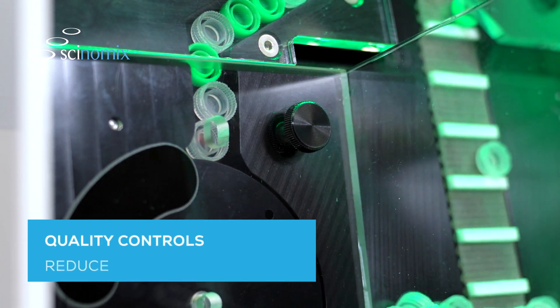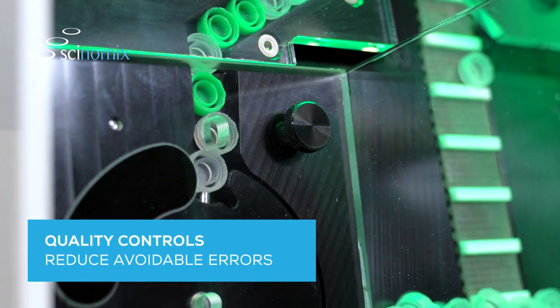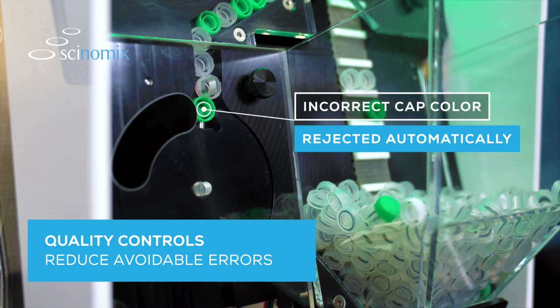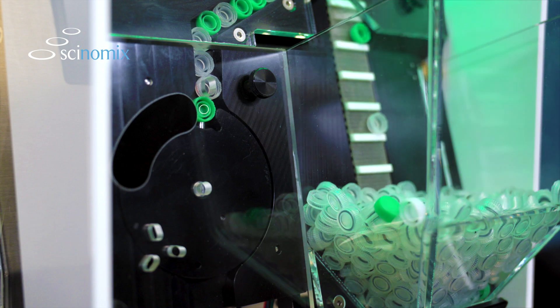RapidCap2 provides an extra layer of quality control with its configurable color filtering capabilities. Incorrect cap colors can be rejected automatically, reducing the risk of human error and the time required to fix avoidable problems.